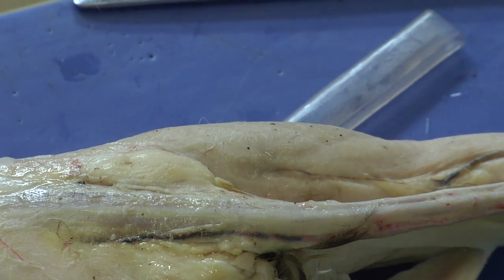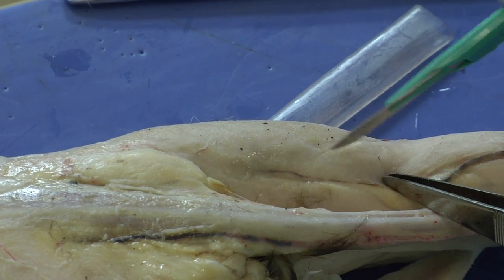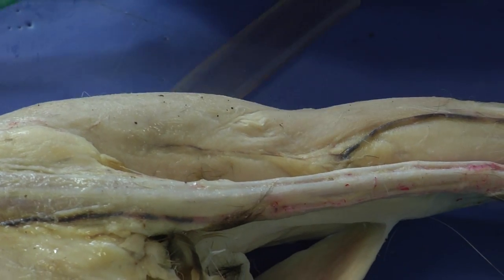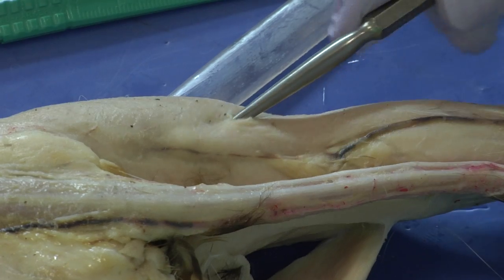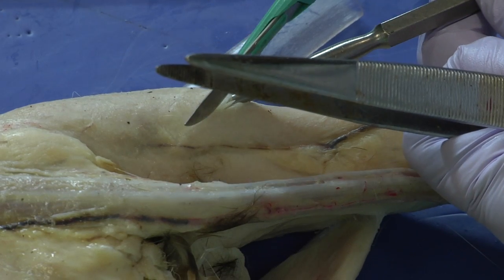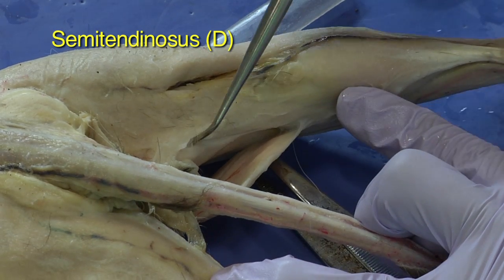And so I'm just going to follow that. And then confirm the separation. All right, so I'm gonna take this up just a little bit more. So we made that cut, and that's gonna be one of the boundary cuts for our semitendinosus, which is here.